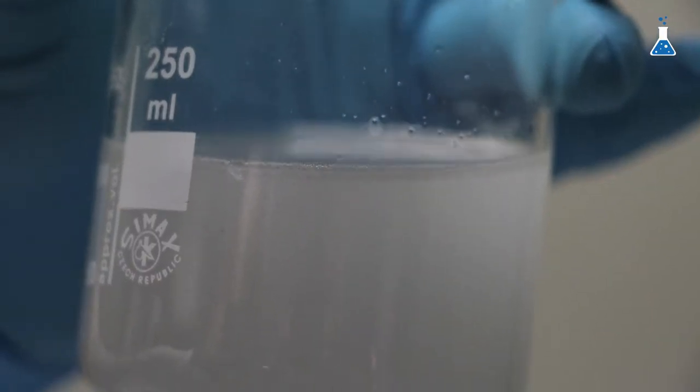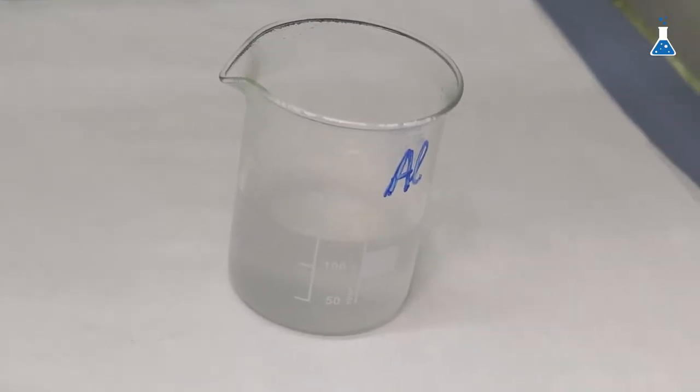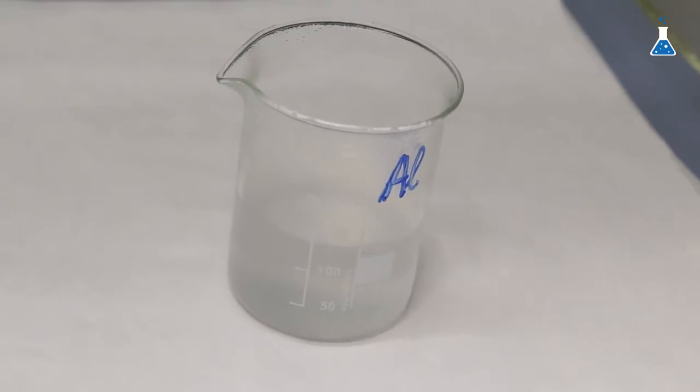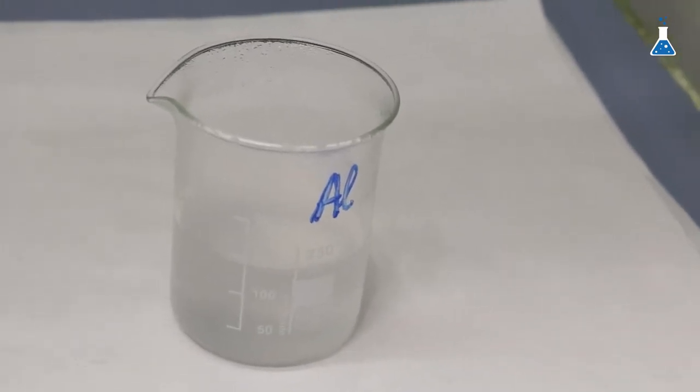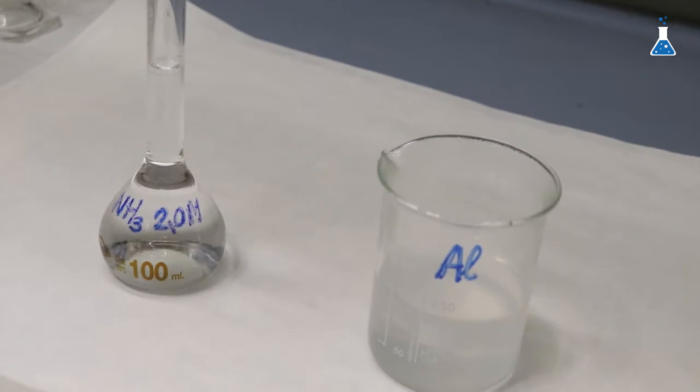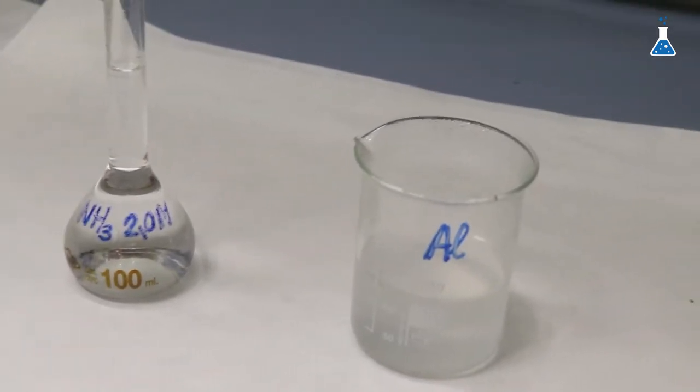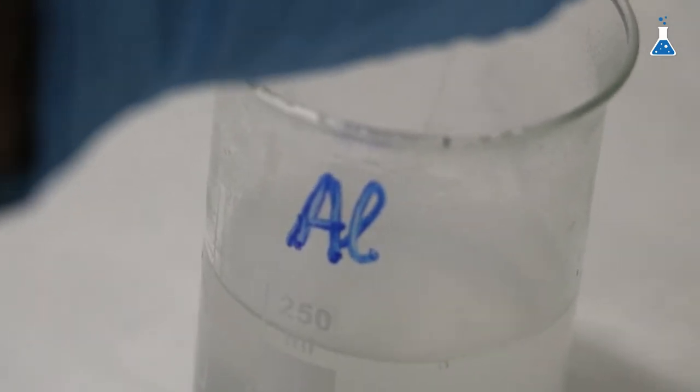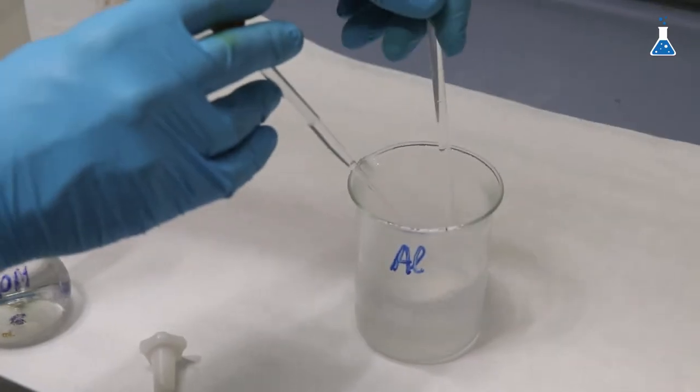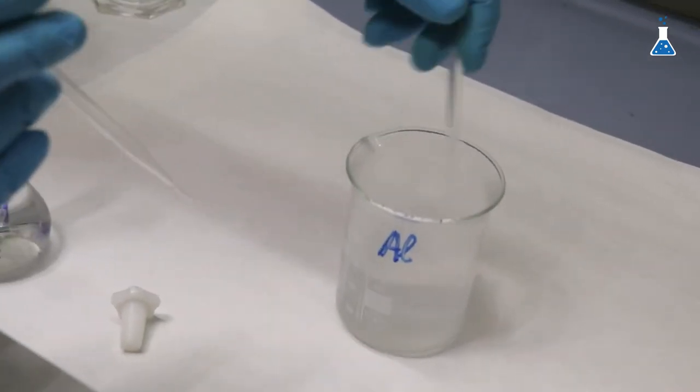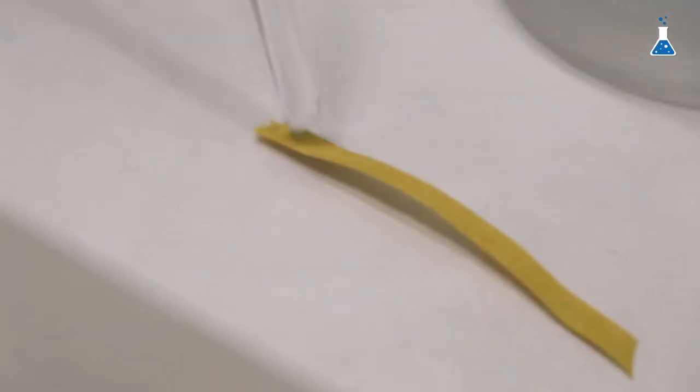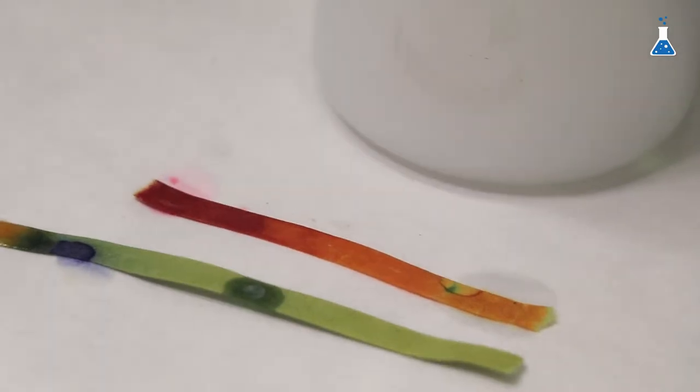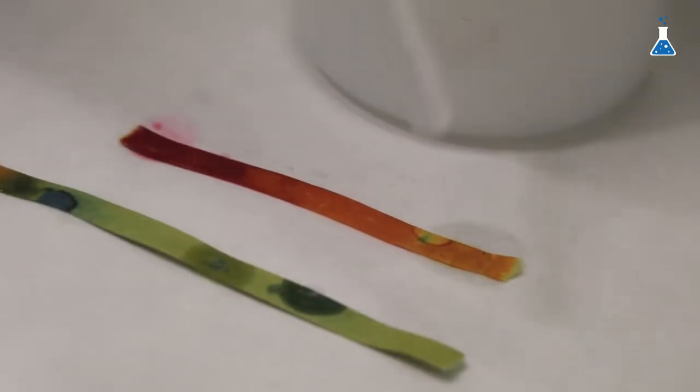As you can see from the effervescence form. So now we have aluminum dissolved in the solution and we increase the pH of the solution by adding some milliliters of 2.0 molar ammonia solution. As you can see, it starts to form a white solid, which is aluminum oxide hydrate. Let's continue adding more ammonia until we neutralize the solution. By simply checking the pH value with some pH strip, we can know when the solution is neutralized.